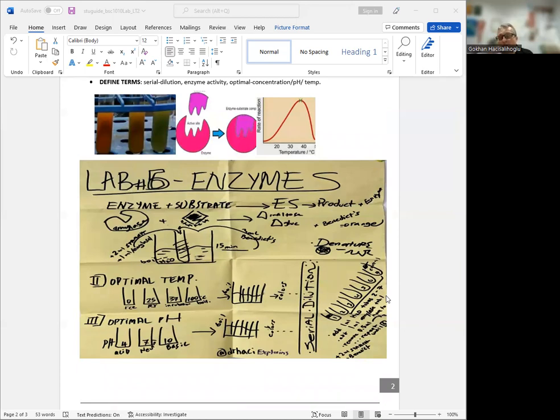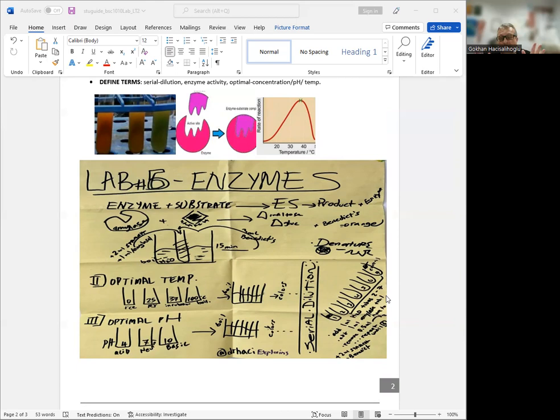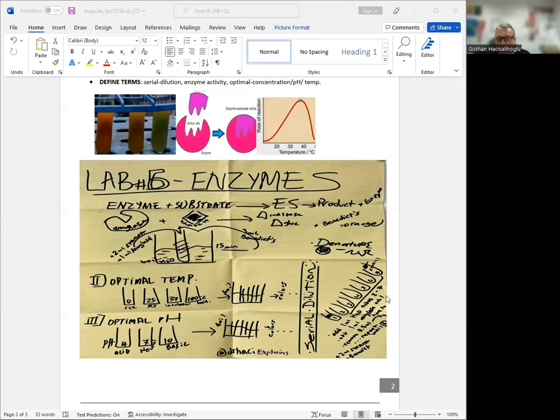For this you need to turn on your heating blocks. Get a large beaker, fill it half with water, and then heat that. We need that heating water to put test tubes in it to warm them up to see color change, like orange color. Which tube is going to give us the best orange? We need to prepare seven small test tubes. Label them one, two, three, four, five, six, seven. Add one ml water in tubes two, three, four, five, six, seven. Add one ml amylase or salivary amylase enzyme from the icebox.